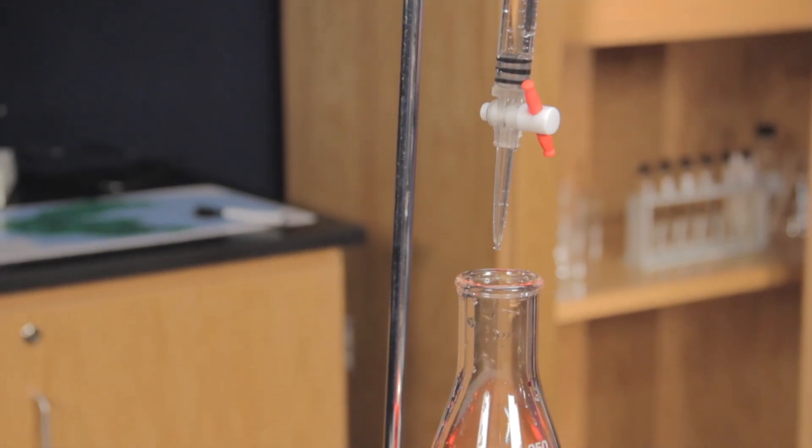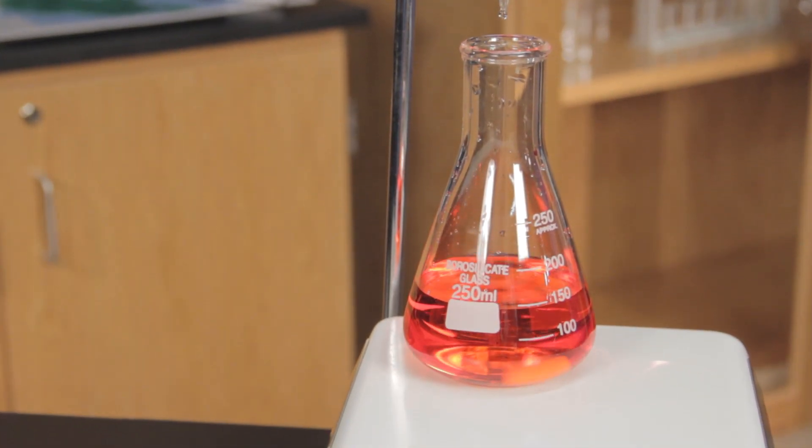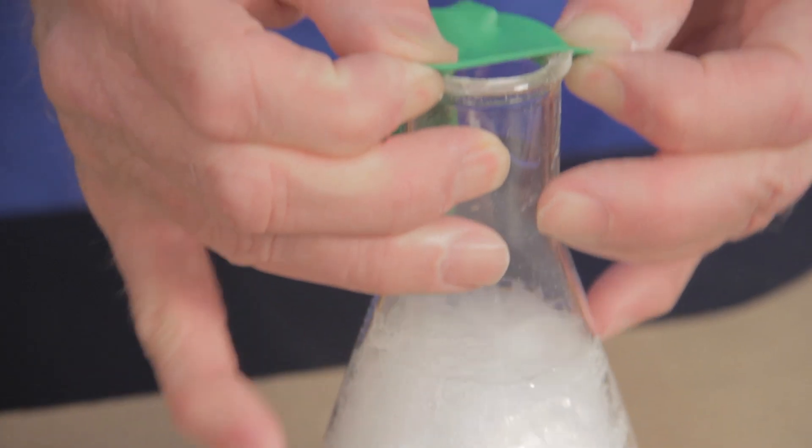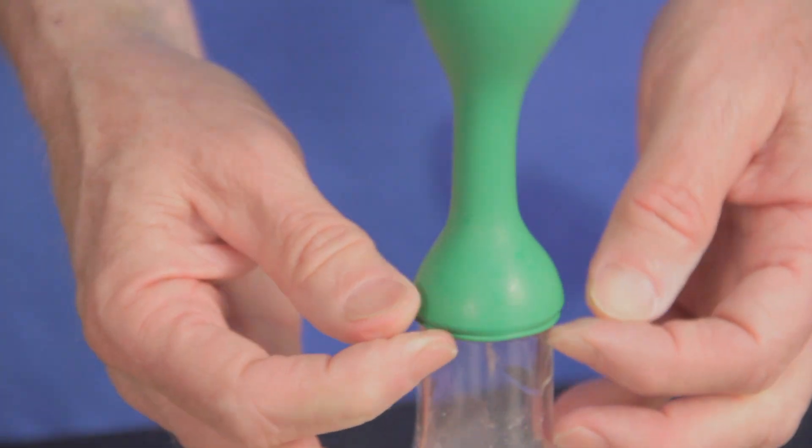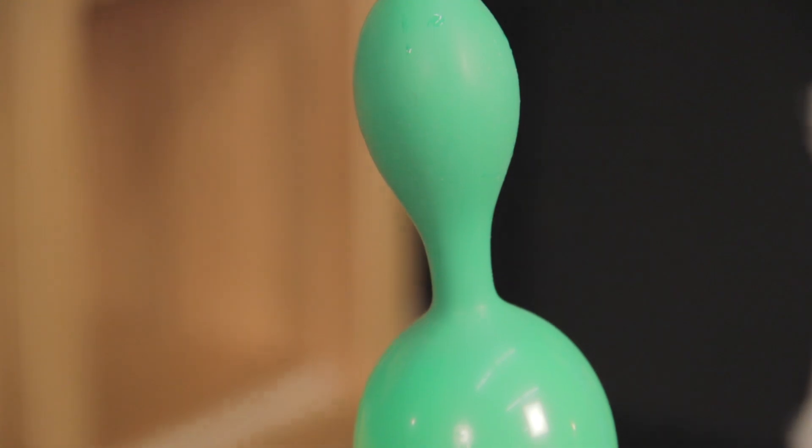Erlenmeyer flasks are also useful in titrations as a container for the solution being titrated. To demonstrate gas produced in a chemical reaction, place a balloon over the opening of the flask to capture the gas. This serves as a great visual demonstration of gas production for students.